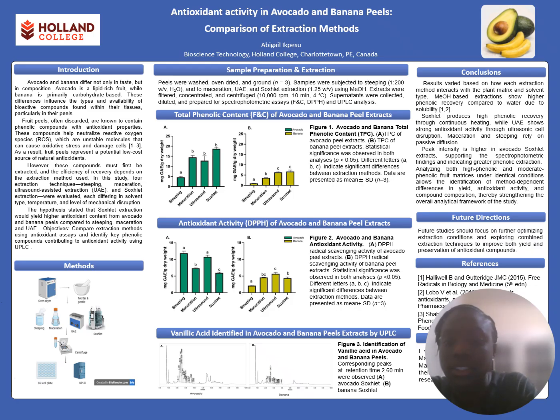which depends on the temperature, the solvent type, and the level of mechanical disruption. I used 4 different extraction methods for these peels. I used steeping, maceration, ultrasound assisted extraction, and the Soxhlet.